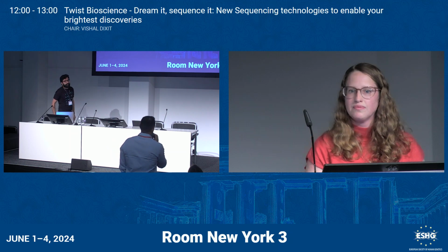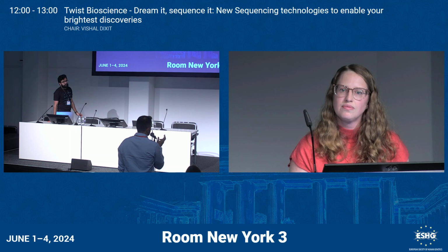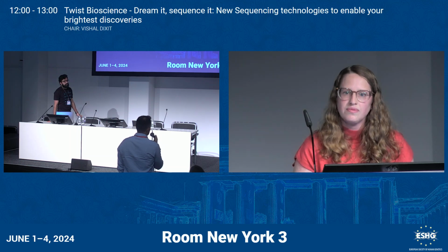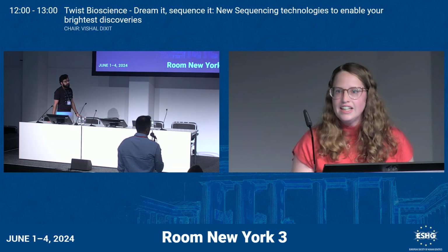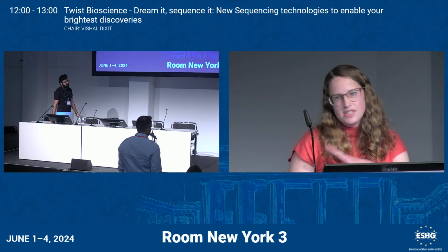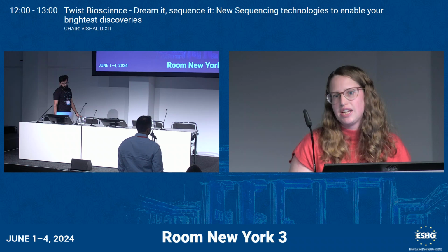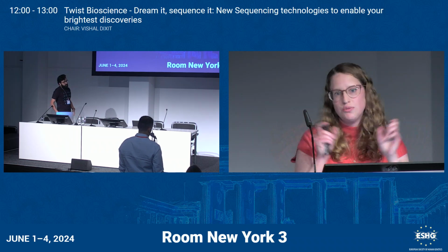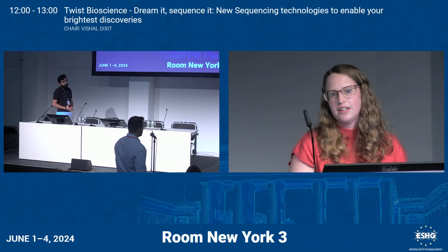Very nice presentation, thank you. I was wondering whether the panel designed for short reads could also be applied for long reads, or did you have to change the panel and all the conditions? Yeah, so we actually explored this together with Twist. That's data I didn't show today, and we found that we needed a very different probe design to be able to capture the long reads. So we actually spaced the probes quite a bit further apart than what you would do with a short read approach, which is often more tiling based. Yeah, exactly. Thank you.